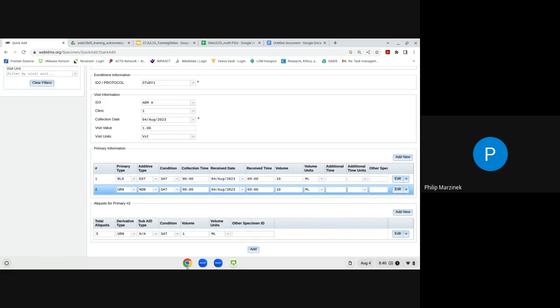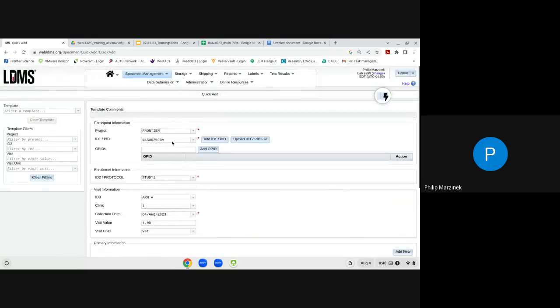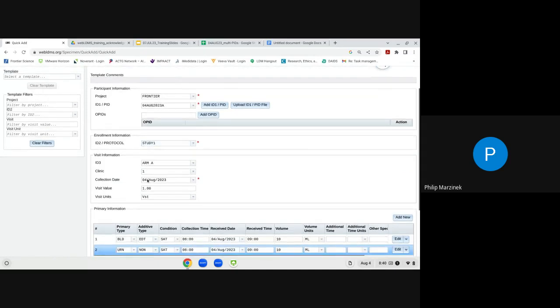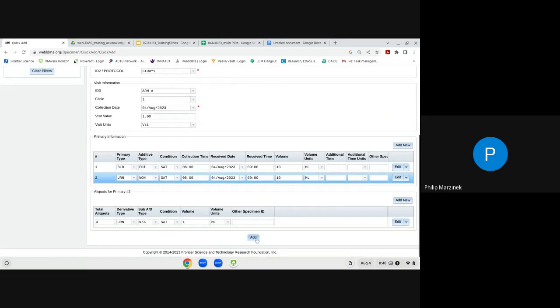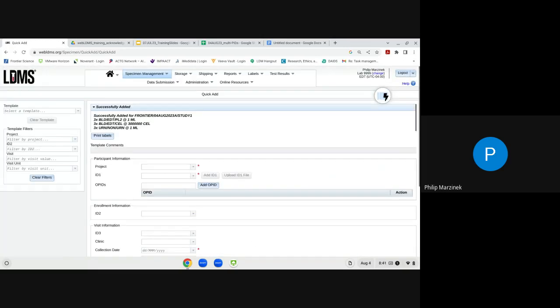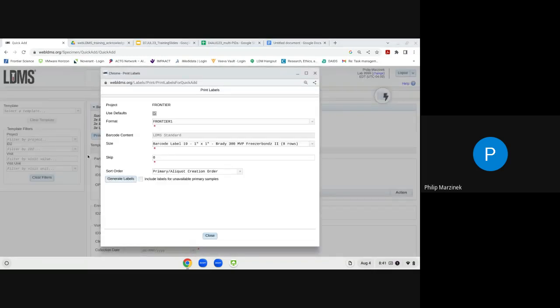Once all participant, enrollment, visit, primary, and aliquot information is entered, click the Add button. If everything is filled out correctly, a success message will appear confirming that three Double Spun Plasmas, three PBMCs, and three urine aliquots have been added. From here, click the Print Labels button to generate labels for this set of nine aliquots.